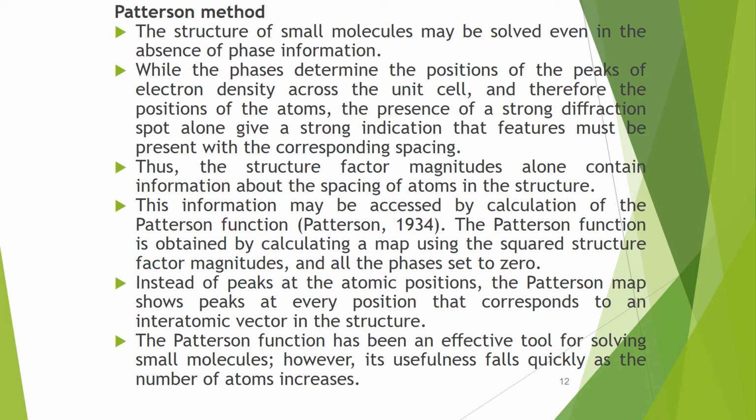The Patterson function has been an effective tool for solving small molecules. However, its usefulness falls quickly as the number of atoms increases.